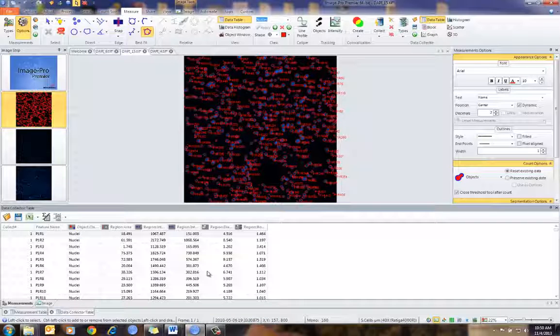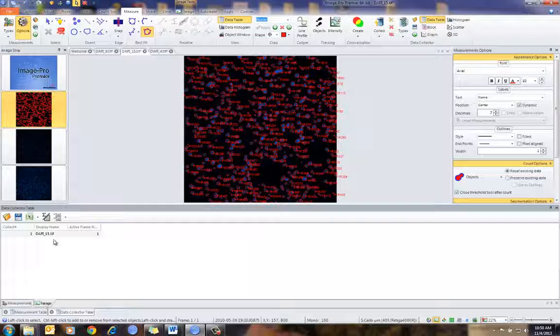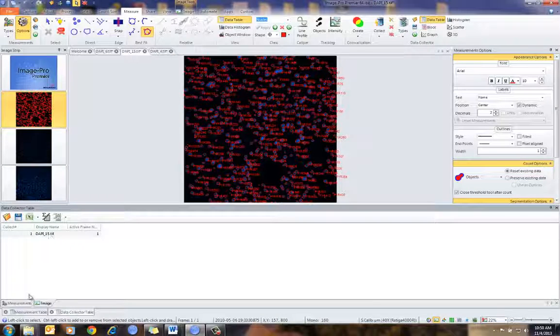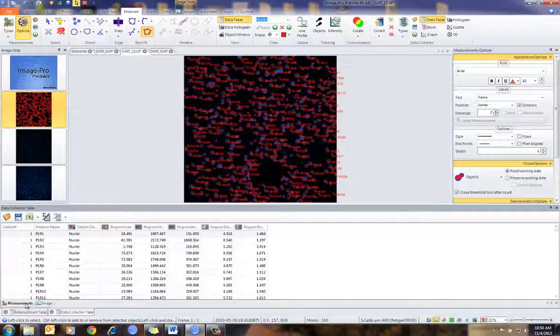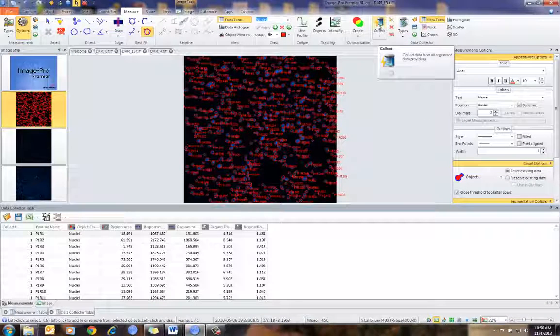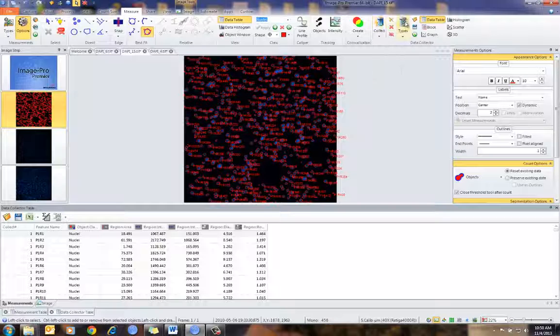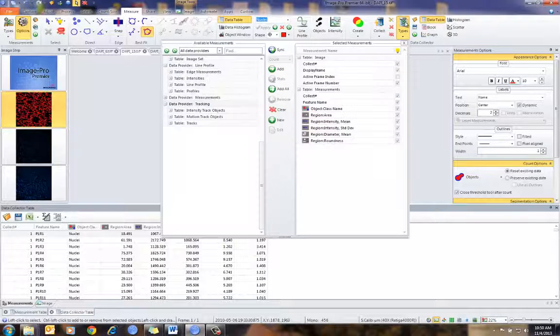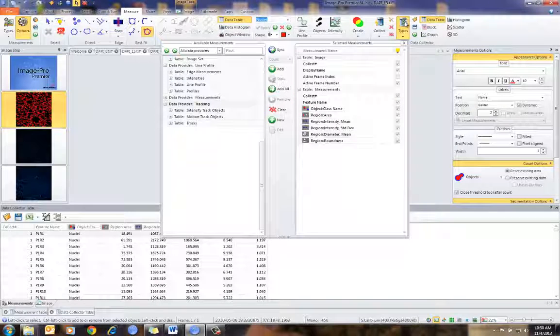I've actually automatically accumulated data in my Data Collector table, and I also have an image table set up to show where the data is derived from. The important thing is when I press the reset button and press count, what that does is automatically go up to Count Size and bring in those measurements — so it's already set up for you.